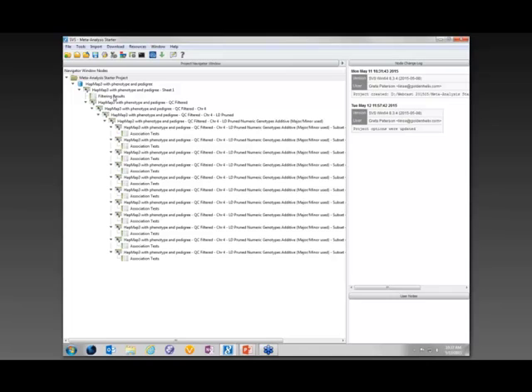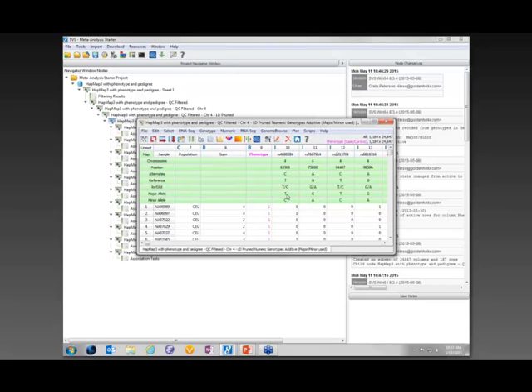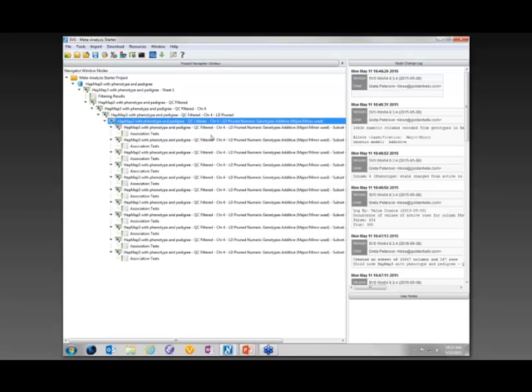I did go ahead and do the same quality filters that I did with the bovine data. I also LD pruned it. I'm only looking at chromosome 4 just to isolate the results. Meta-analysis does not take very long to run, but this will help us just focus on one area. And after I did the quality control filtering, chromosome down to chromosome 4 and LD pruning, I went ahead and recoded this into a numeric additive model, 0, 1, and 2. And again, that adds the major and minor allele into the spreadsheet, which ensures that I'm working with the same strands.